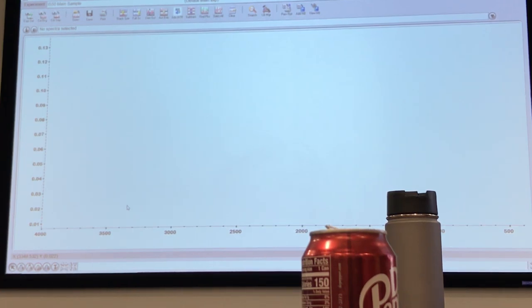But yes. The reality of how complex all of these matches are says to me that all the mapping software that people are hoping is just going to make a map of what's there, that's not going to work. I don't know. Don't be pessimistic. It's going to work. It's totally going to work. Should we be going through 100,000 spectra one by one to make our spectral maps, or should we be trying to automate this procedure?